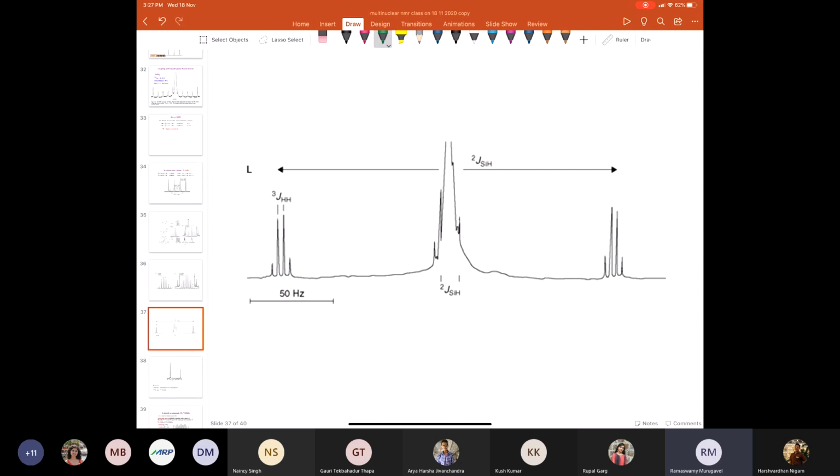I think one example I just want to show you, but not talk about it; I want you to go home and see it. This is your Si2H6 spectrum. For my 438 students, this may look like repetition, but for others it's new. So you have a silicon here and a silicon here, 3 hydrogens.